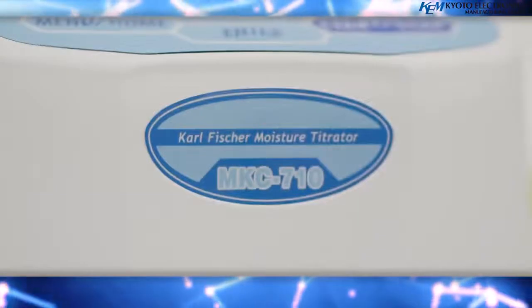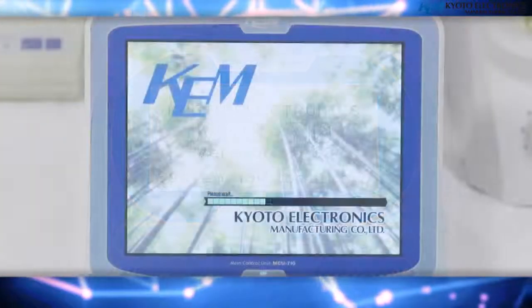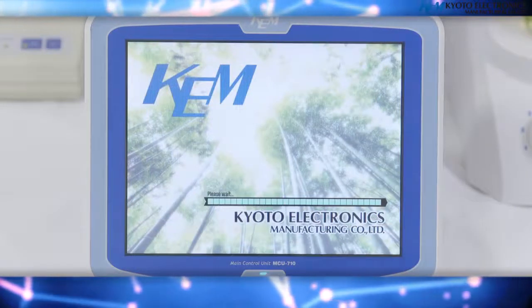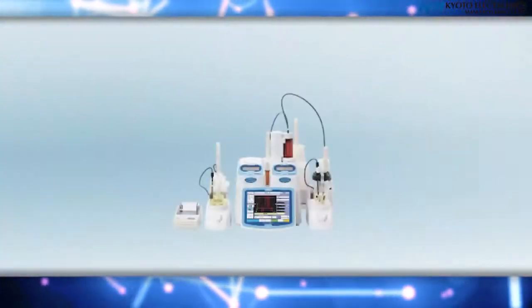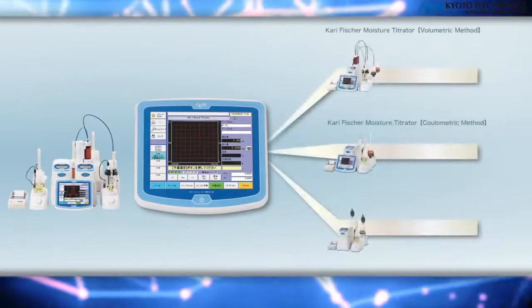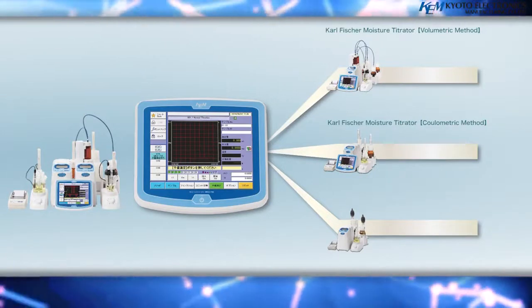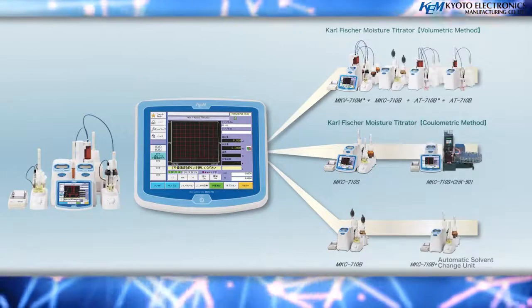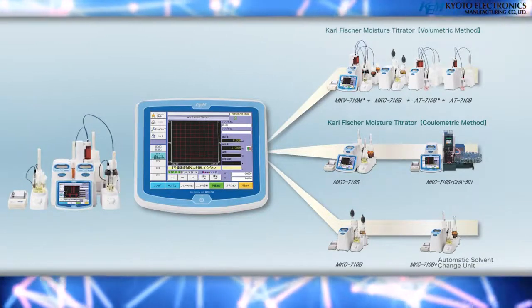By connecting up to 4 moisture titrators, measurements can be performed simultaneously in parallel and contribute to saving space. Not only can the Karl Fischer moisture titrator's coulometric titration, MKC710B, and volumetric titration, MKV710B, be connected, but the automatic potentiometric titrator, AT710B, can also be connected as well.